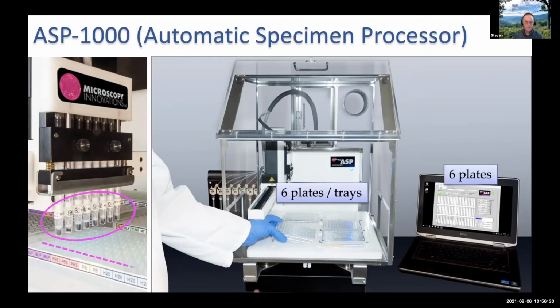So there are positions for 6 plates and trays. So one can do a lot of different reagents along this way. The plates can be covered or sealed to reduce evaporation, as you can see in this photo in here. You can use different types of plates to vary the volume. Obviously, lower volume plates for expensive reagents and more for rinses. And you can organize the plates in any way you desire for a particular preparation protocol.